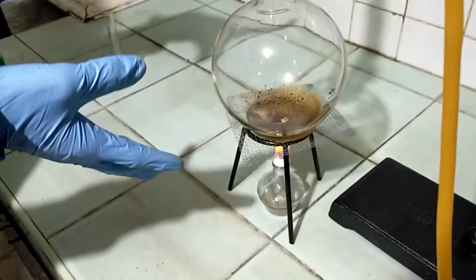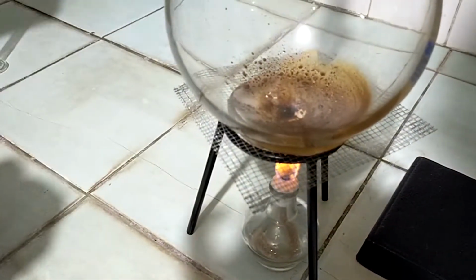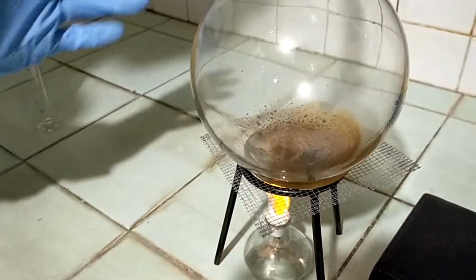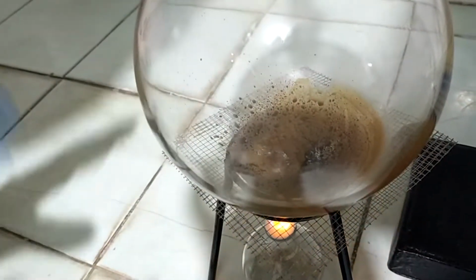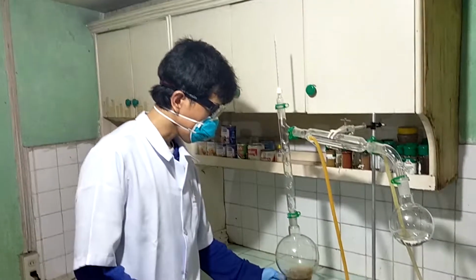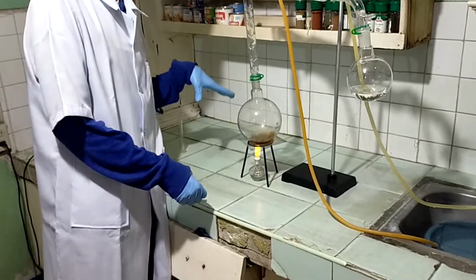After we have condensed the contents of this flask to full dryness, then we will use ethanol to recrystallize this impure caffeine into caffeine. Okay, now you can see that there is smoke coming from this part of the distilling column, which means that this is almost at dryness. There's only a very little part of the liquid left in the distilling flask. So we'll only wait for a while, then we will proceed with recrystallization. Okay, so this is almost done. I'm not going to let the remaining ethyl acetate distill. I'm just going to let this evaporate.